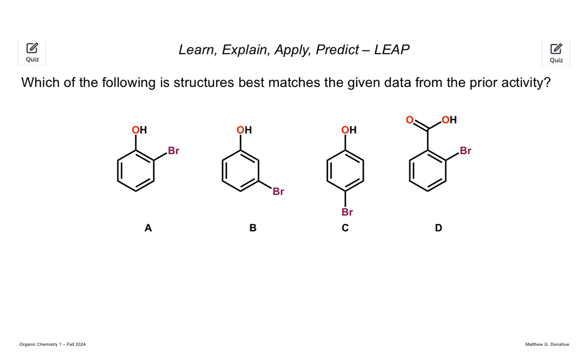So even though I don't have the data up there, you know, the answer I believe is A. Let me scooch back. So we eliminated C because there was more than 2 unique sets in the proton. We eliminated D because there was no carbonyl in the IR. B was eliminated because there was no singlet to it.